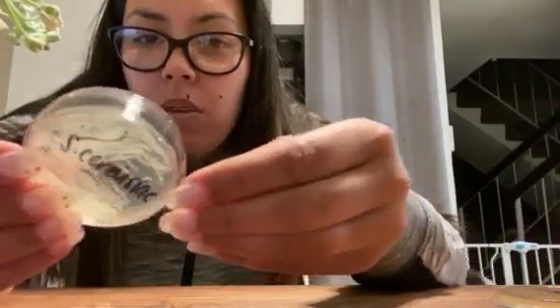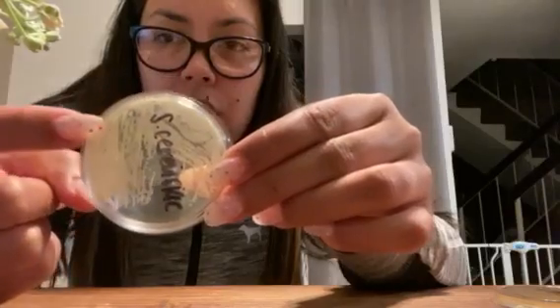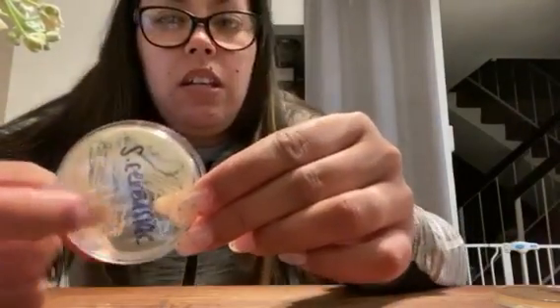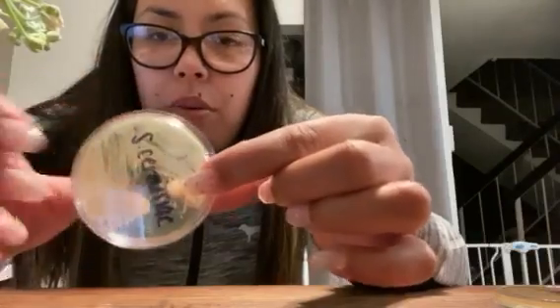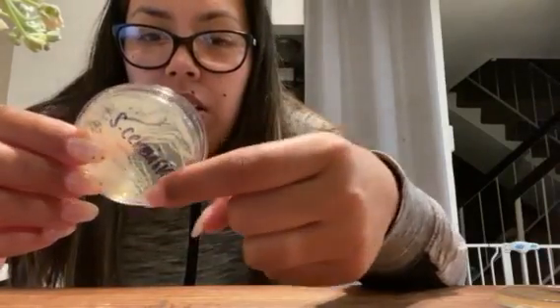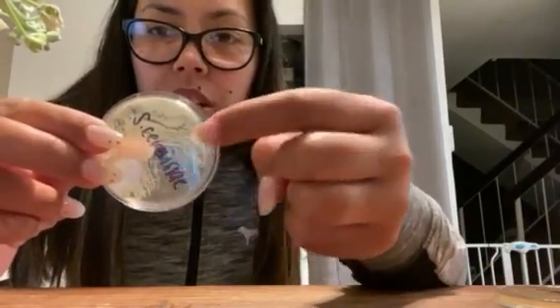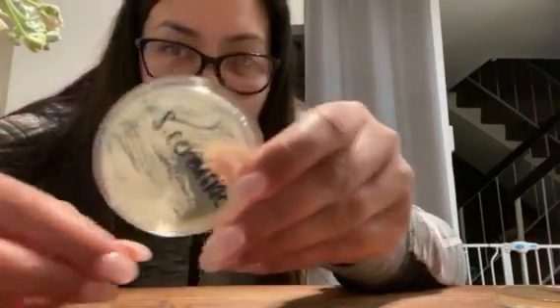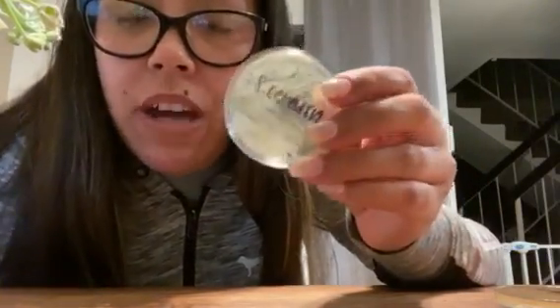The next one is the S. cerevisiae one, the yeast. So this one had a lot of growth as well. It's really filled in right here on this portion, and then you can see where I streaked it here. And then there's also some spotted growth. It looks like really big specks up on this region, and then it's clear here, so I'm not sure why that happened. I might have not streaked it properly over here from this quadrant over, or vice versa. But there is still a lot of growth on this one, which makes sense because in the tubes there was a lot of growth showing faster than the other ones.